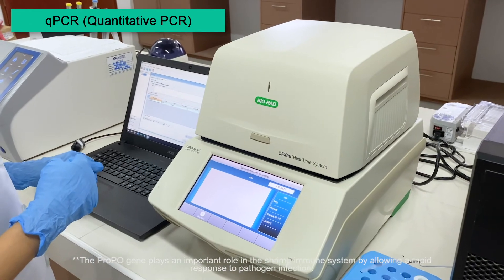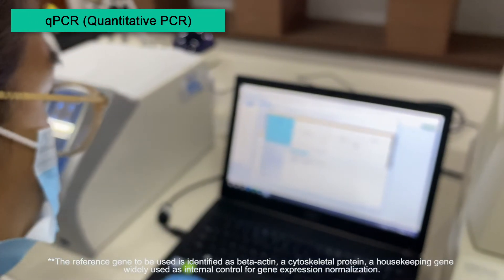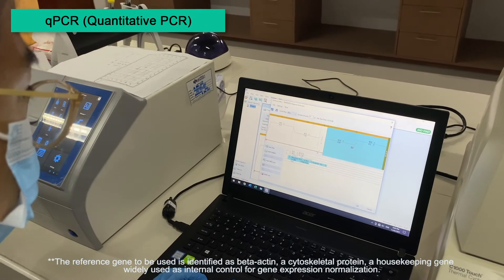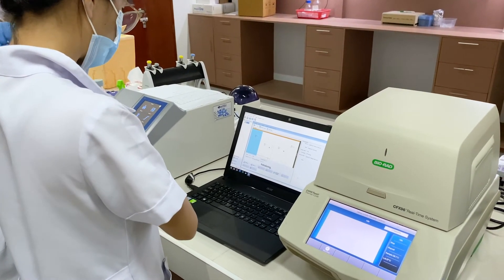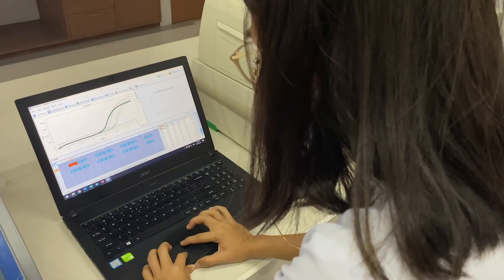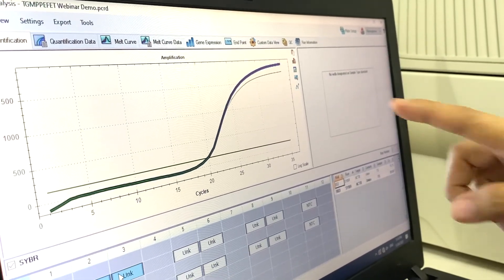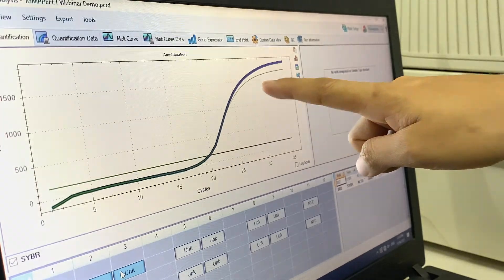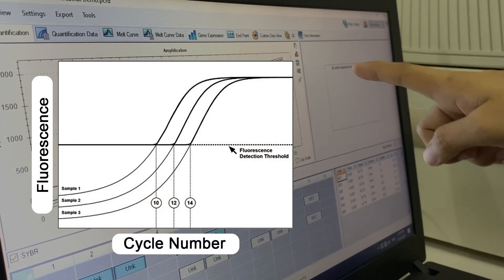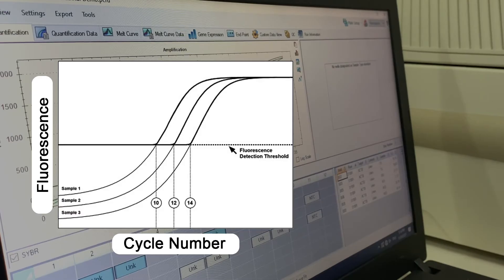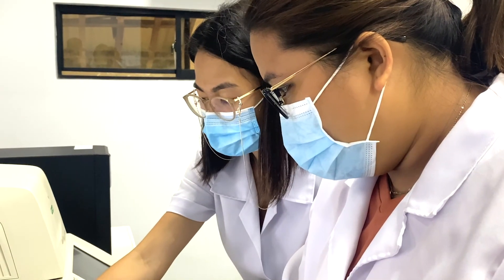For this experiment, the gene expression of prophenoloxidase will be investigated between treated and untreated samples. Once the cycling and melt curve analysis is completed, the instrument software automatically provides amplification curves showing the fluorescence on the y-axis against the cycle number on the x-axis. This data is now ready for further calculation and analysis.